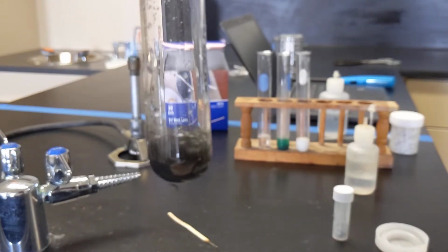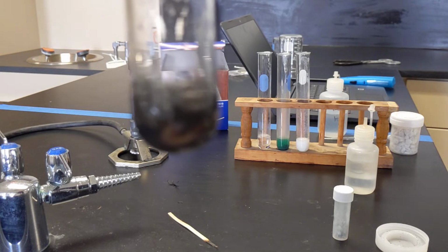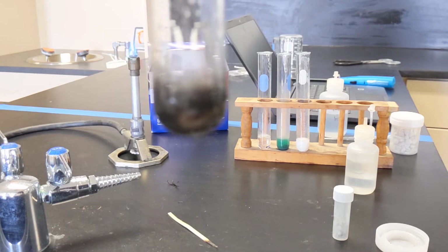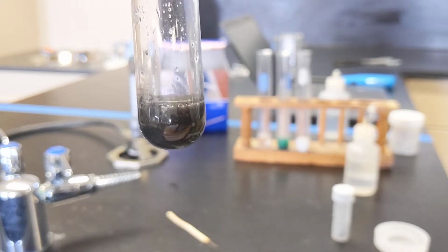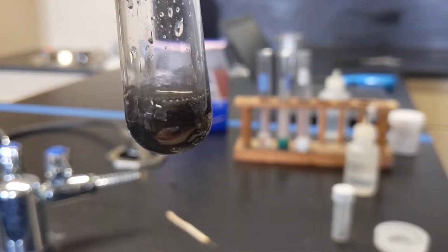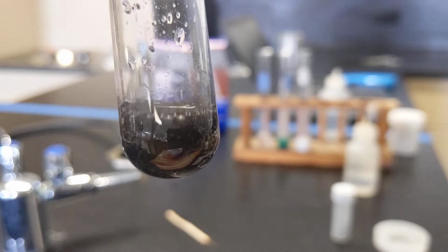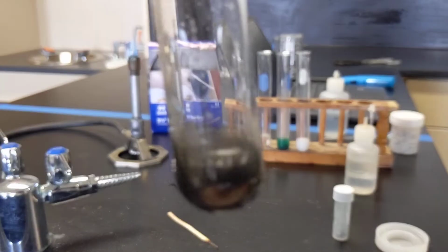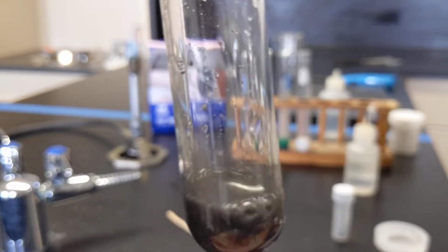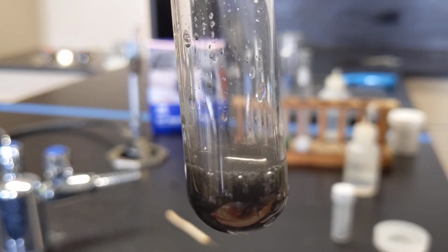And hopefully you can see what's going on. Again, it's hard to see with the camera focusing a whole bunch, but there it goes. There are some bubbles being formed. I'm going to put my thumb over the top to try to capture the gas.